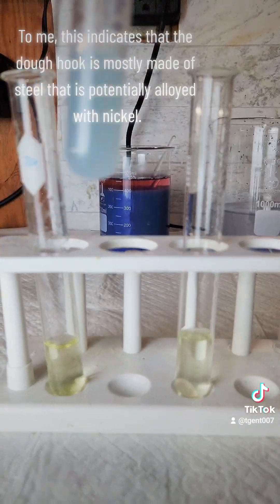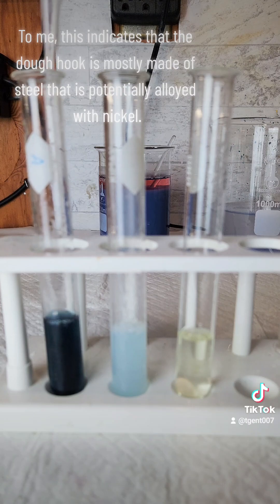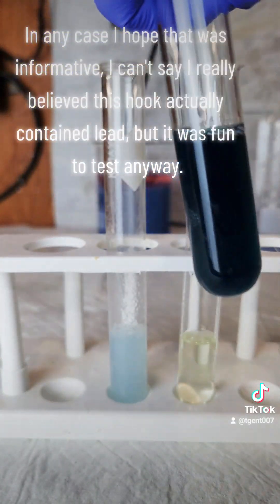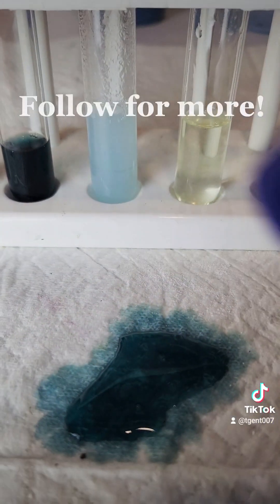To me, this indicates that the dough hook is mostly made of steel that is potentially alloyed with nickel. In any case, I hope that was informative. I can't say I really believe this hook actually contained lead, but it was fun to test anyway. Follow for more.